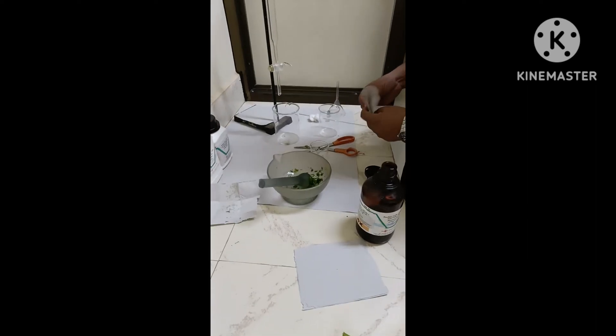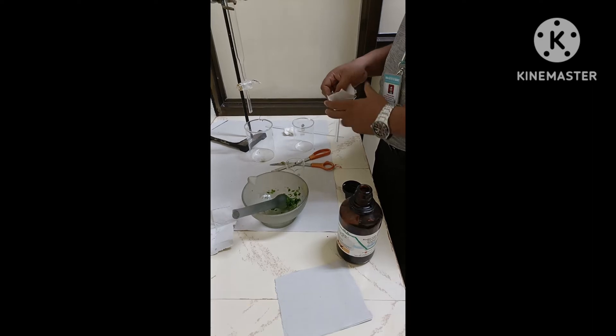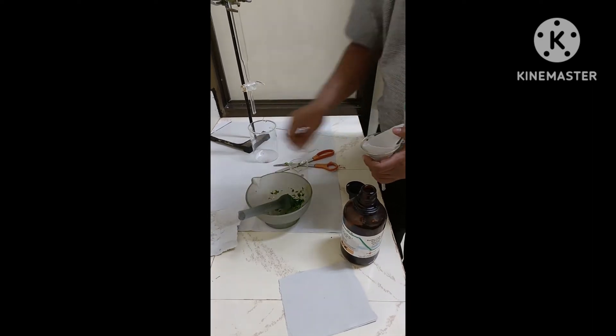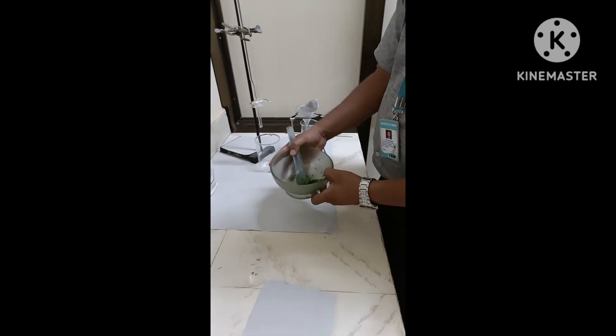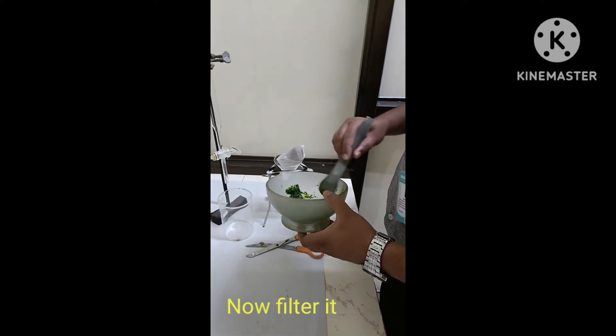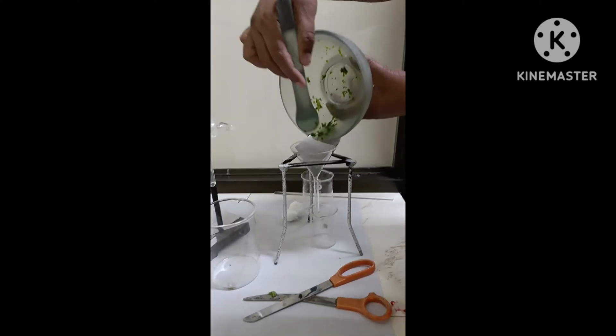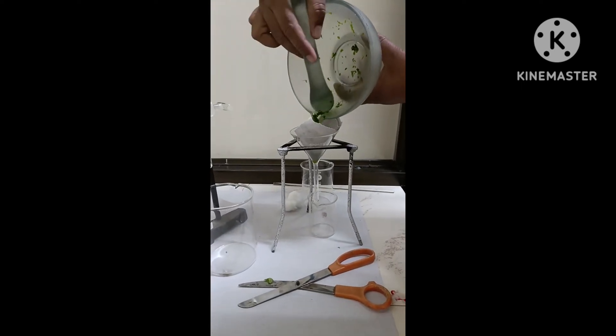Now we can add a little amount of acetone in the triturate and then transfer to the separating funnel. Now we can filter out using the simple filter paper and we can get the extract.